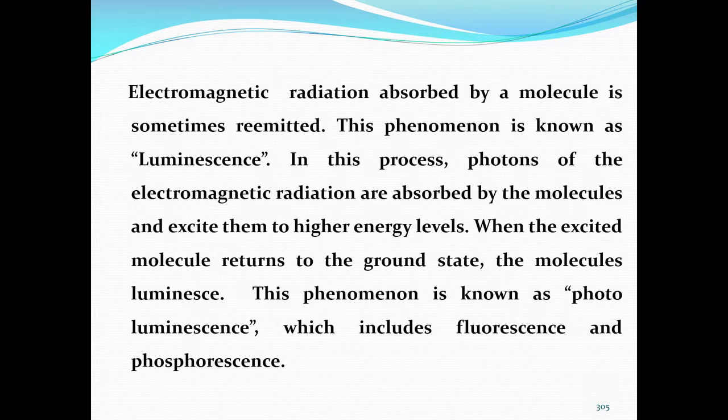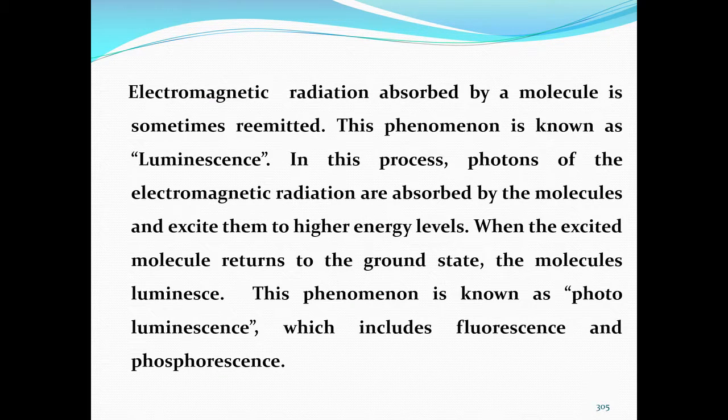Now, I hope you remember our discussion about electromagnetic radiation, how it is absorbed by a molecule, and the absorption phenomenon is accompanied by the reduction in the intensity of the incident light. And sometimes if the solution is not clear, there will be scattering, turbidity, nephelometric phenomenon, reflection and refraction.